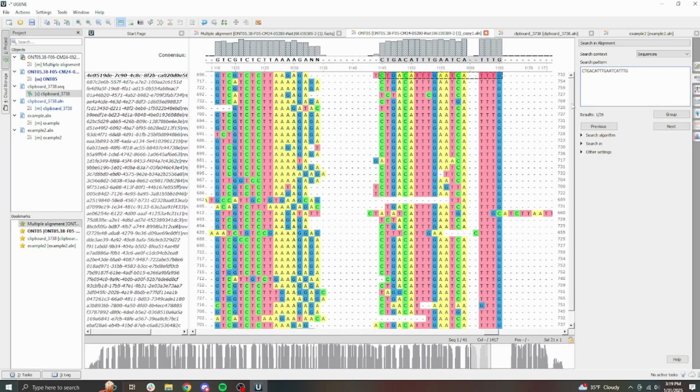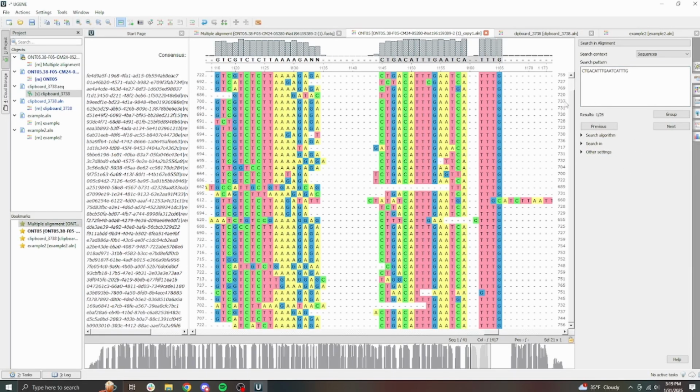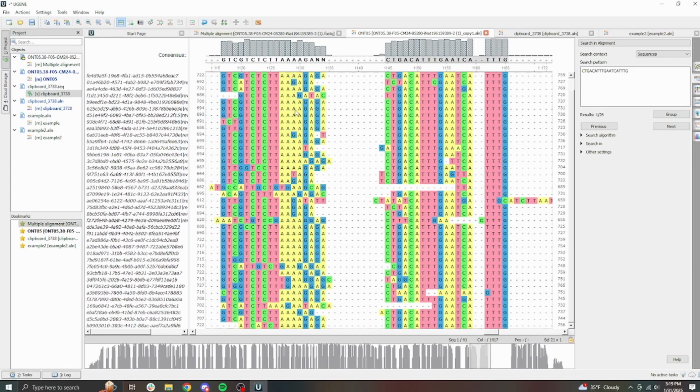Not as strongly expressed. And I do find Nanopore occasionally has trouble reading these homopolymer repeats, like these repeating regions. And so you'll end up with situations where there's a shift of one frame here and one frame here and one frame here, right? And I could, if I want to, start going through and adjusting that alignment manually.